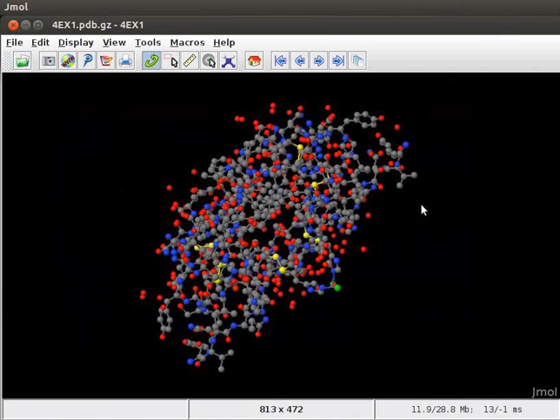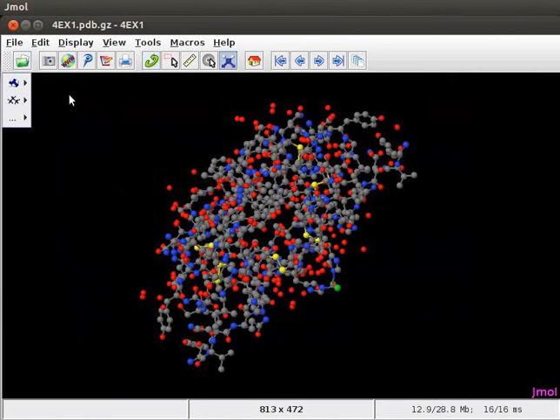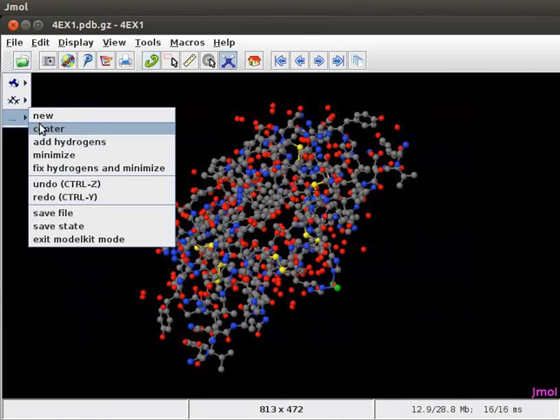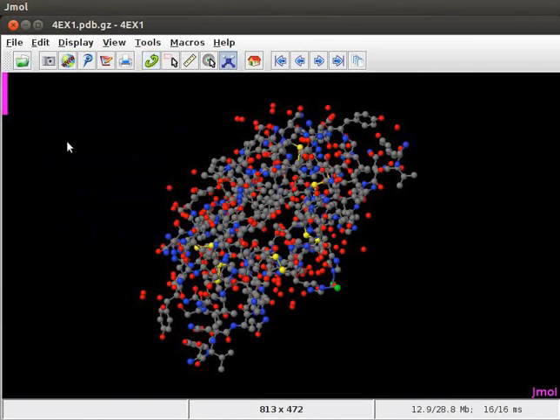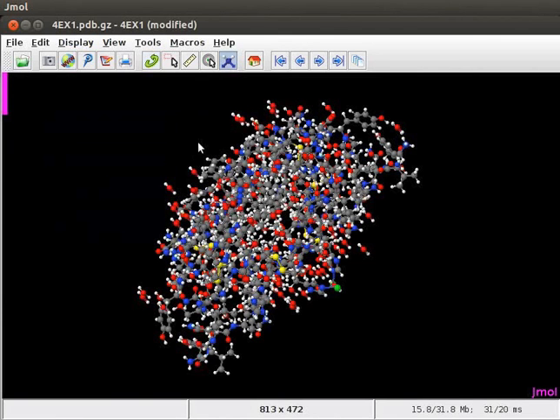To show the model with hydrogen atoms, open the model kit menu. Scroll down to add hydrogens option and click on it. The model on the panel is now displayed with hydrogen atoms.